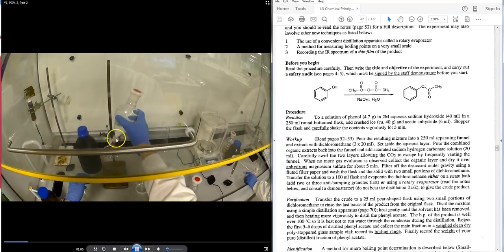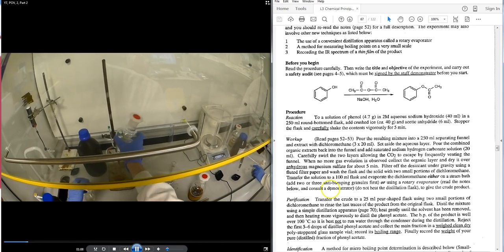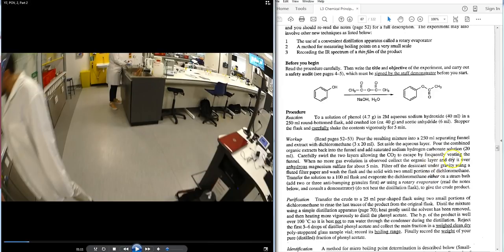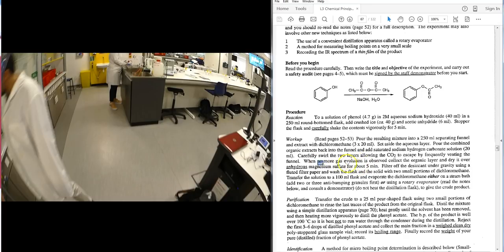After washing with sodium hydrogen carbonate, the bottom DCM layer is collected into an Erlenmeyer flask and dried with magnesium sulfate. It is then filtered under gravity using fluted filter paper into a pre-weighed flask.